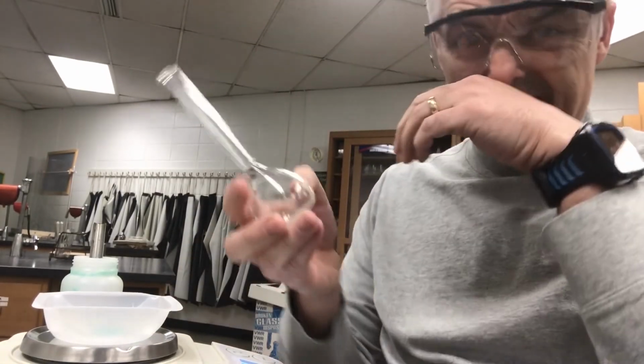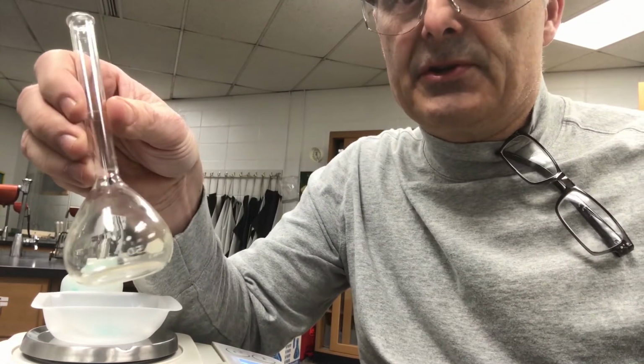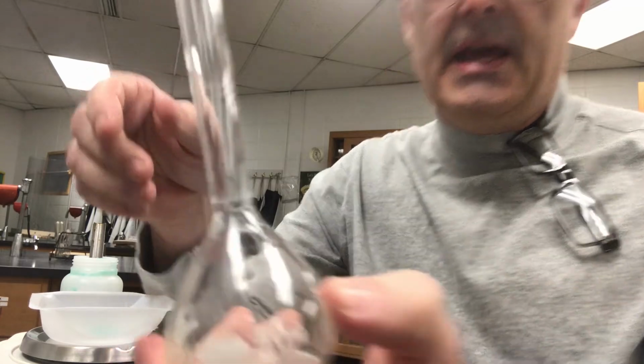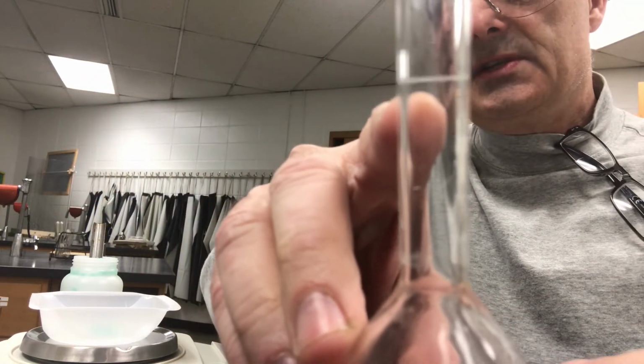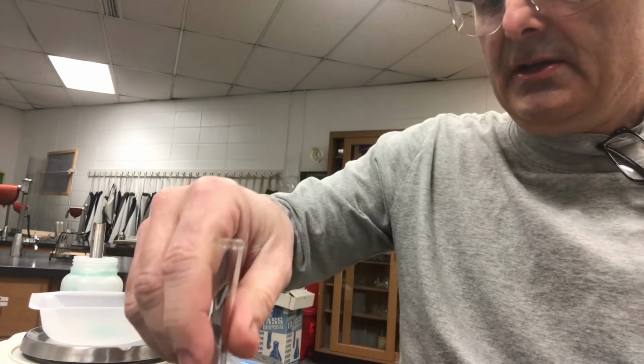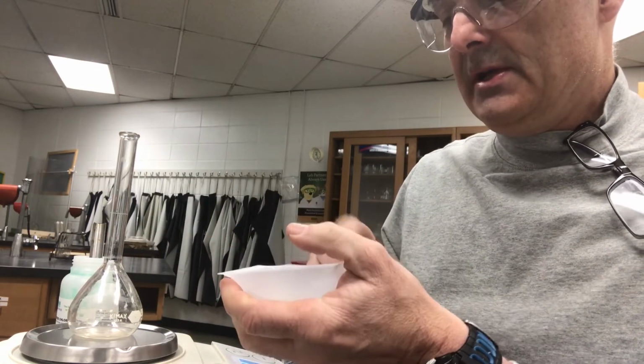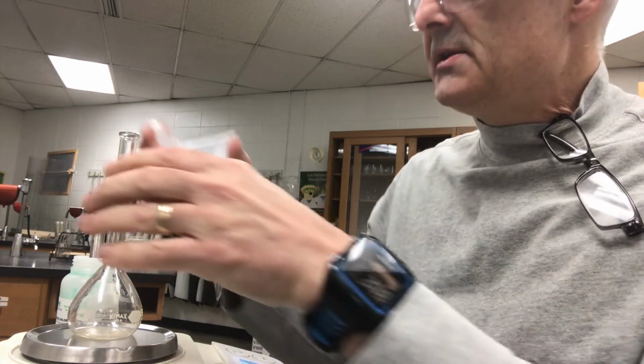And then to make it super accurate, we're going to add it to a volumetric flask. Now these volumetric flasks are super duper accurate flasks, and they have just one line. You can see the one line right there. So now all I need to do is add this powder to this flask. Crazy simple.